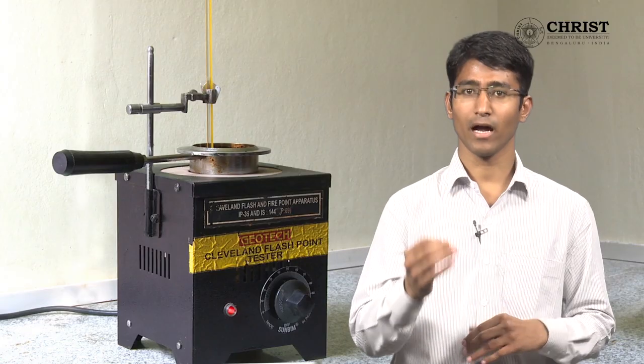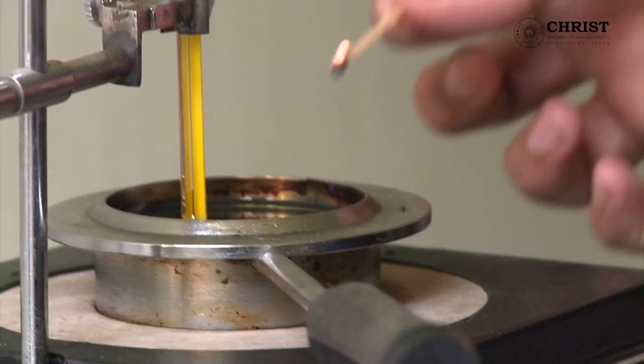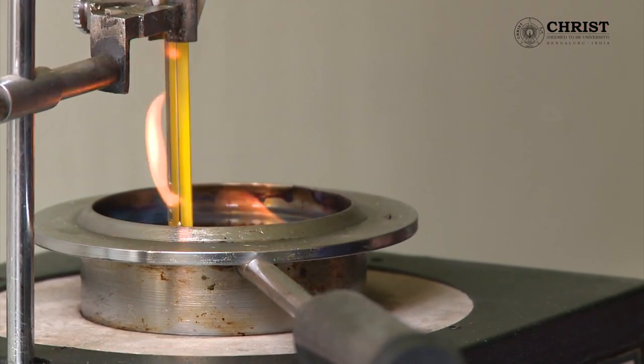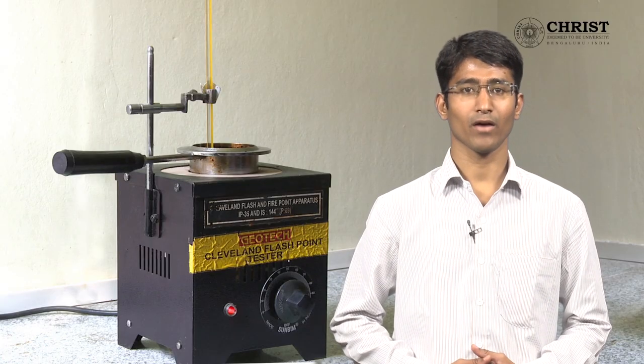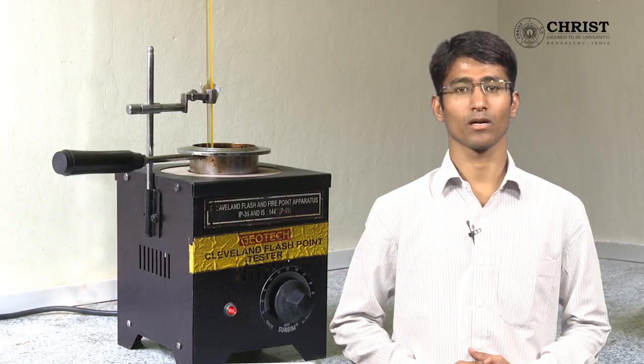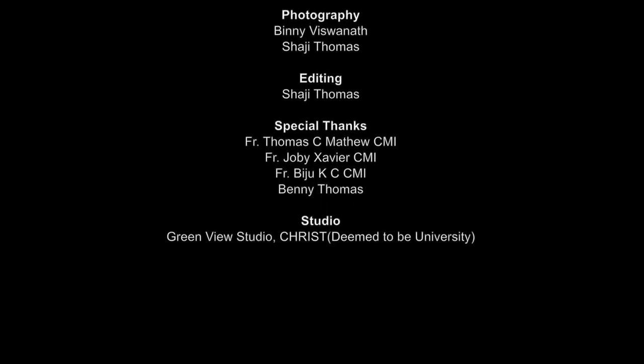Repeat the procedure until you get the fire point temperature. After a while you can see clearly that continuous fire occurs on the surface of the fuel. Thus we found out the flash point and fire point temperature using the Cleveland open cup apparatus.